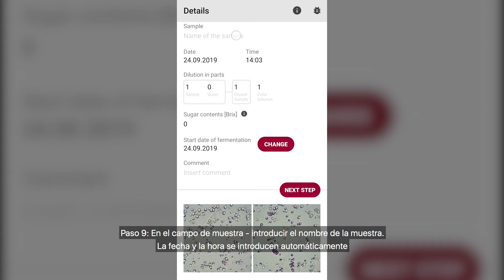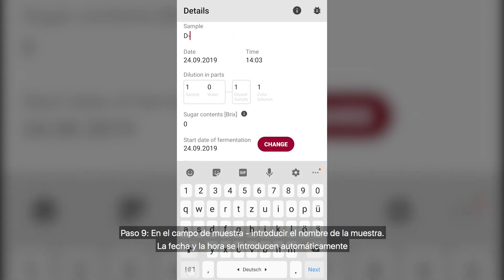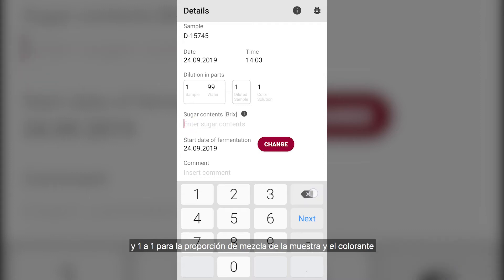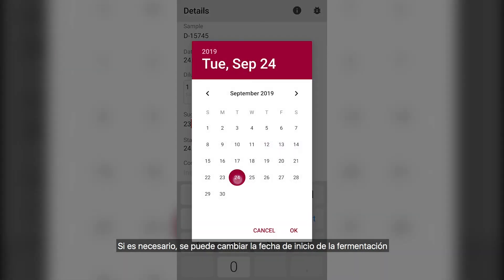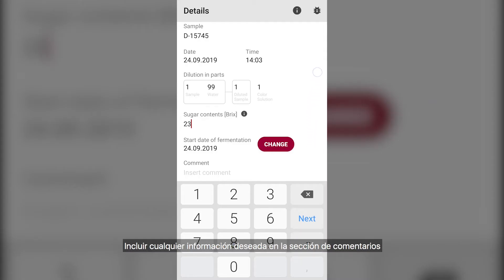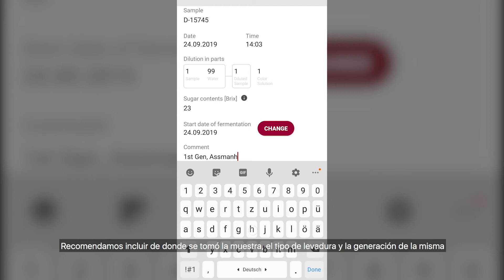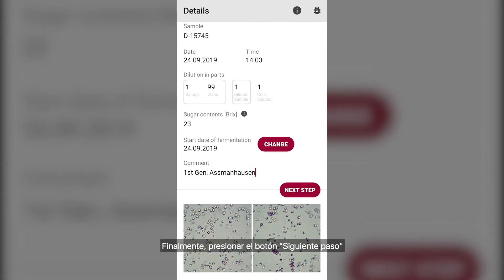Step 9: in the sample field, enter the name of your sample. Date and time are automatically entered. If you followed this video, you can enter a one-part sample and 99 parts water for the dilution, and one-to-one for the sample mix ratio of coloring agent. If required, you can change your start date of fermentation. Include whatever you would like in the comment section — we recommend noting where the sample was taken from, the type of yeast, and the generation of yeast. Finally, press the Next Step button.